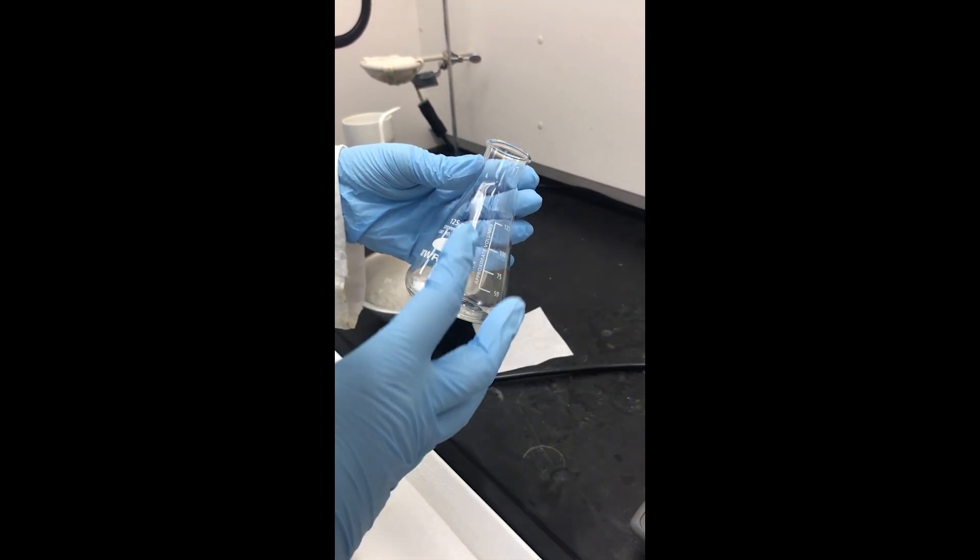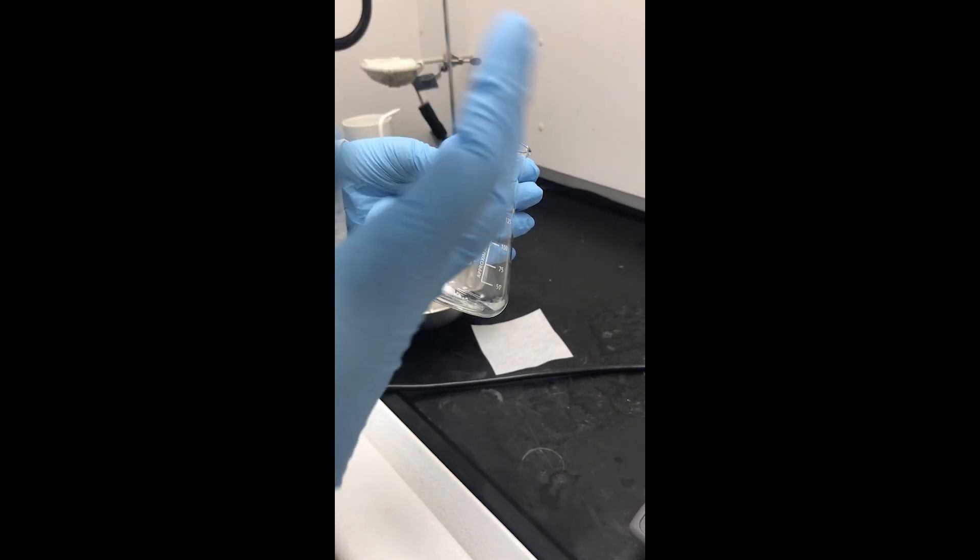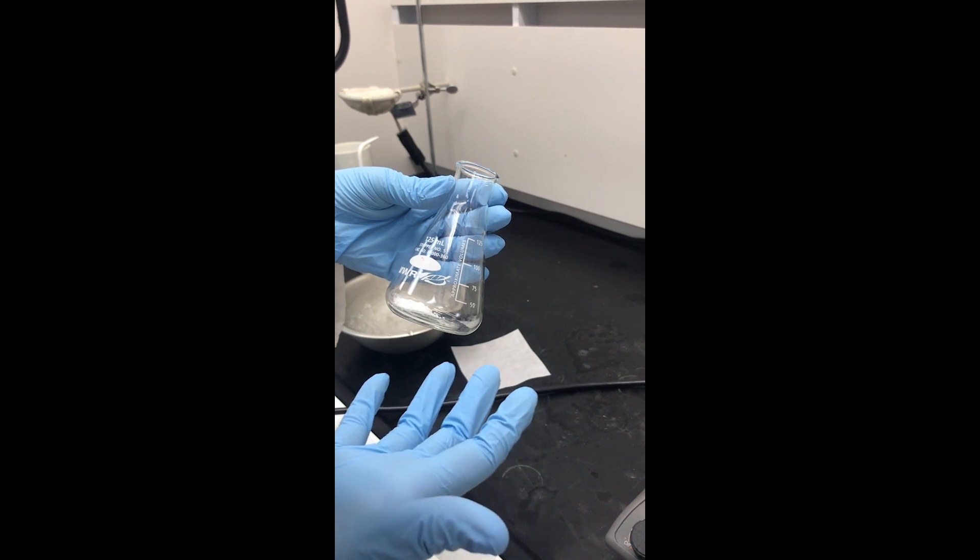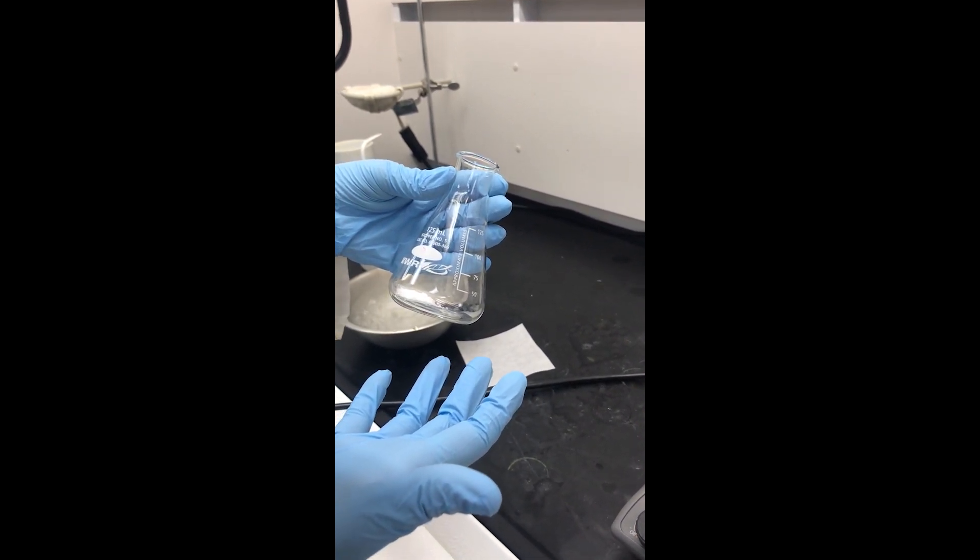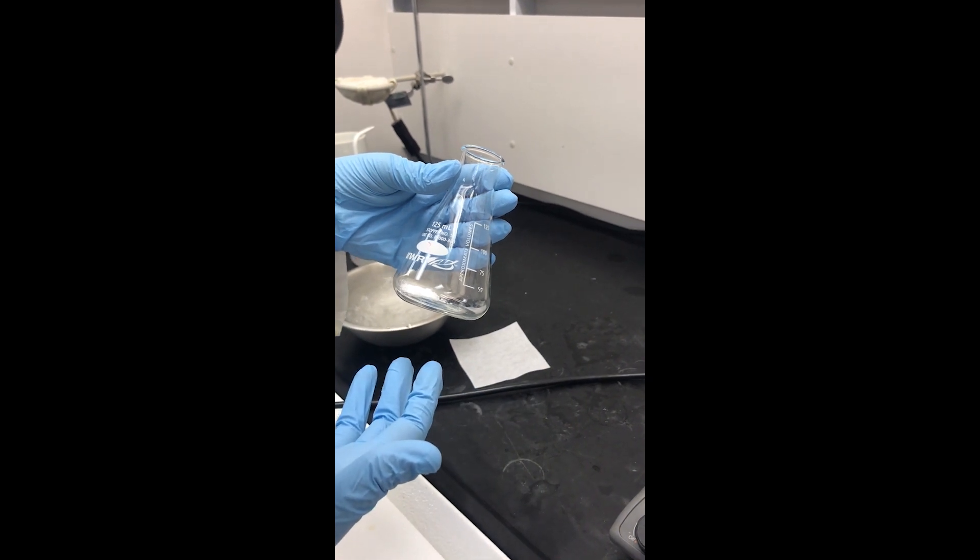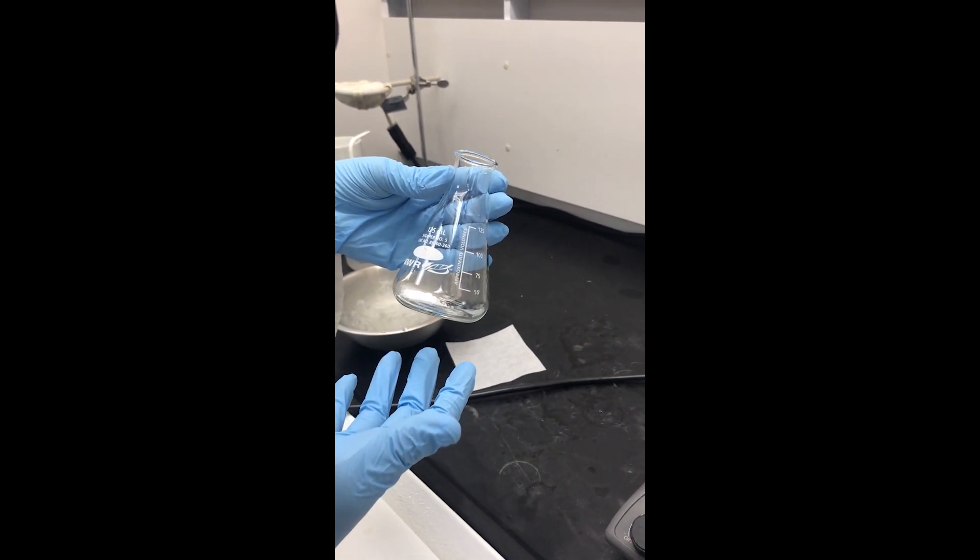The point is that we want to add the minimum amount of hot boiling solvent to the solid so that it all dissolves. We don't want to add too much because then during the cooling process it may not reach super saturation and you may not actually get any crystallization to occur. Then you're going to have to heat off some of the solvent and it's going to be a much longer process if you end up adding too much from the beginning.